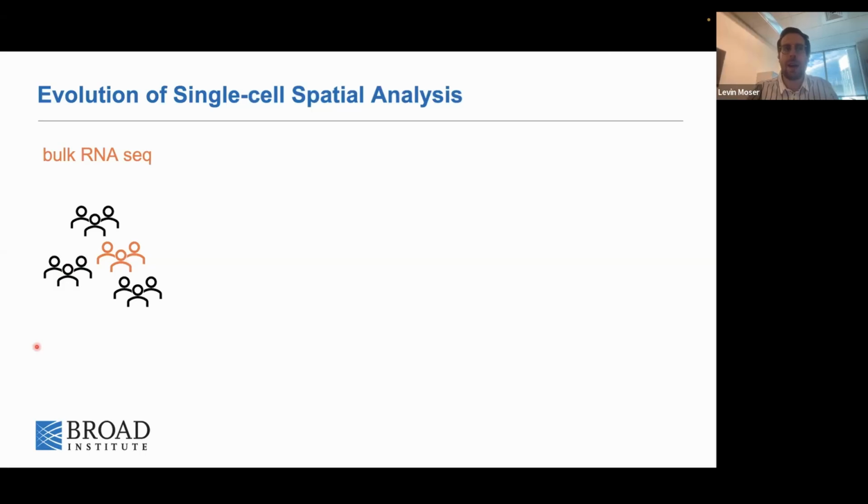But you end up averaging over multiple cells, over all these groups. So the information that you get is averaged, right? It's not very specific. It's not single cells. And obviously, the bigger these groups are, the more averaged out or more general the information is. And then if you decrease these groups and get smaller and smaller groups, you have more precise information about your tissue.